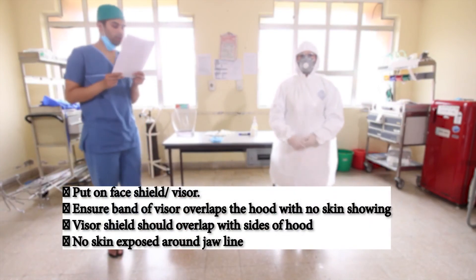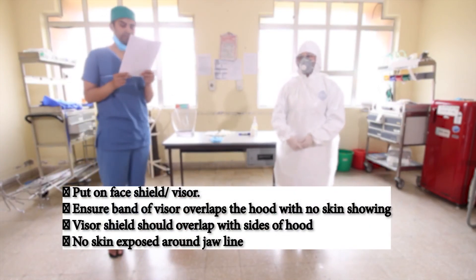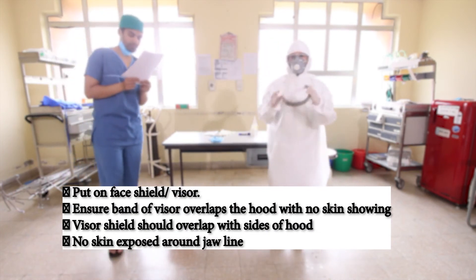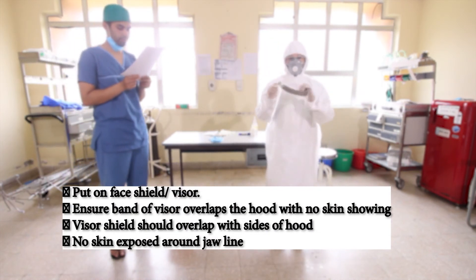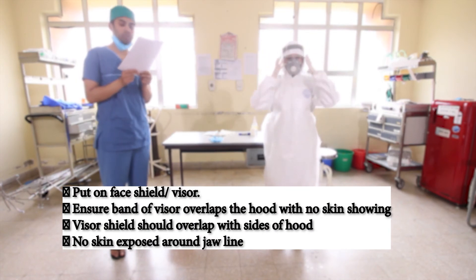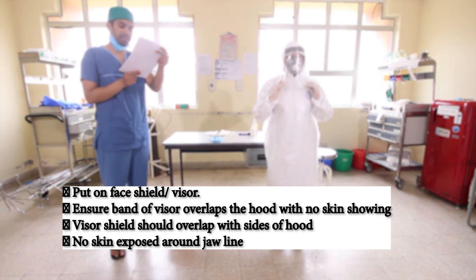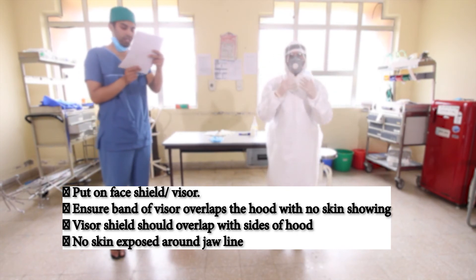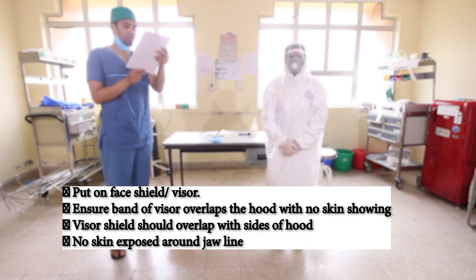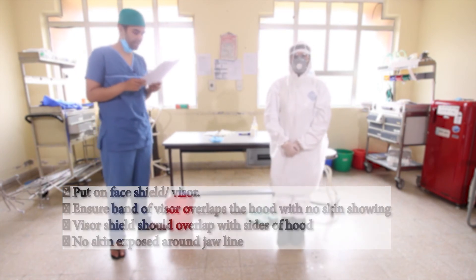After this, put on the face shield or visor if available. Ensure that the band of the visor overlaps the hood with no skin showing. The visor shield should overlap with the side of the hood, and no skin should be exposed around the jawline.